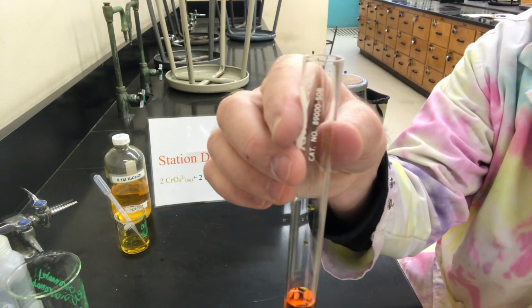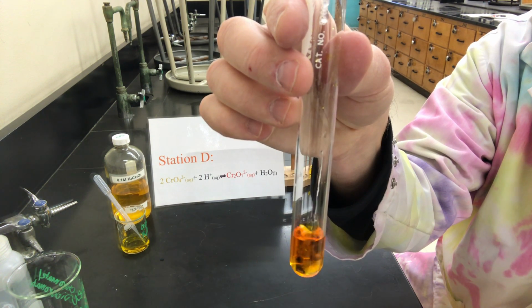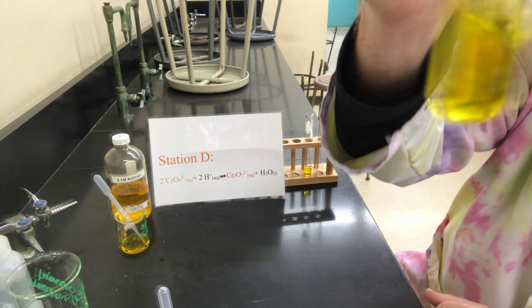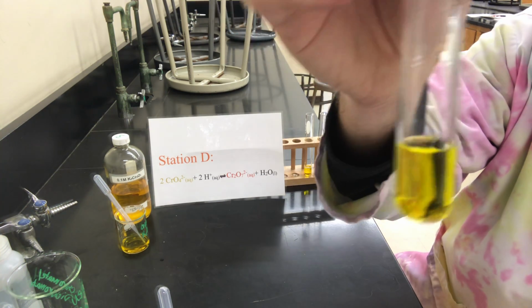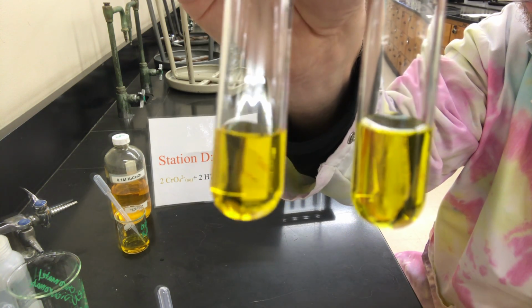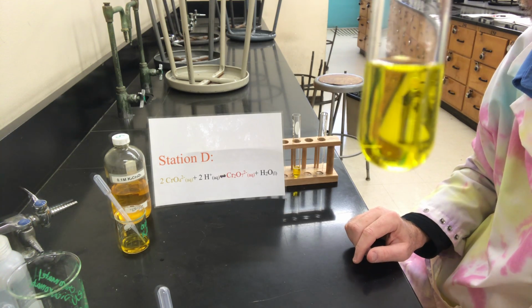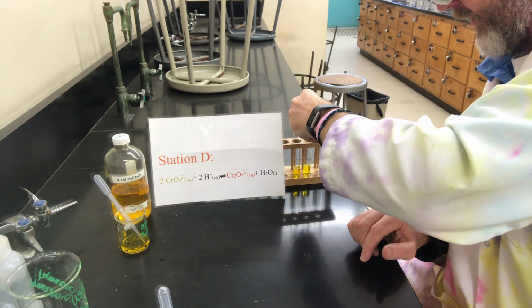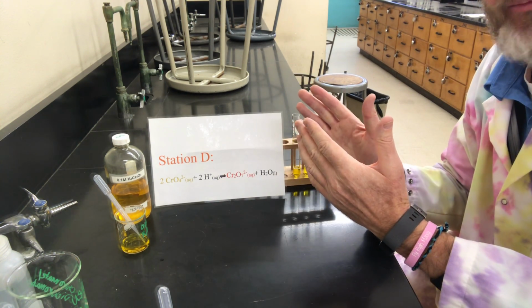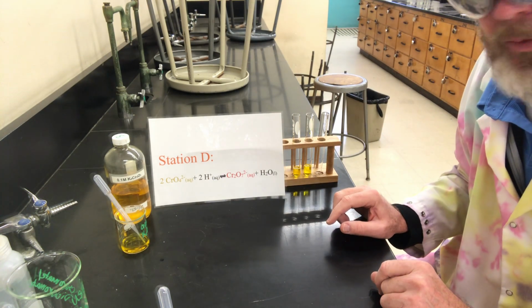Okay, here we go. Change color back to our control. So it lost some of that orange, went back to yellow. Okay. So hopefully we're starting to see how we're pushing equilibrium to the right or to the left. We can keep going back and forth if we want.